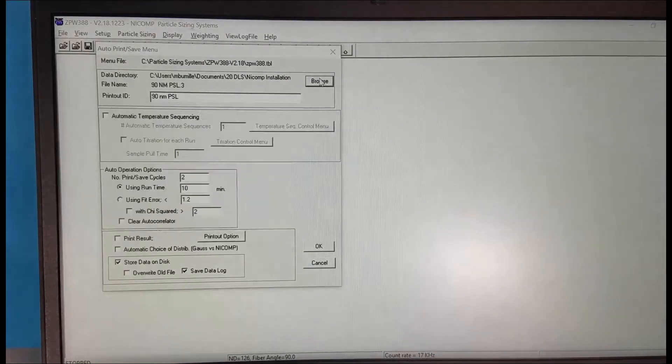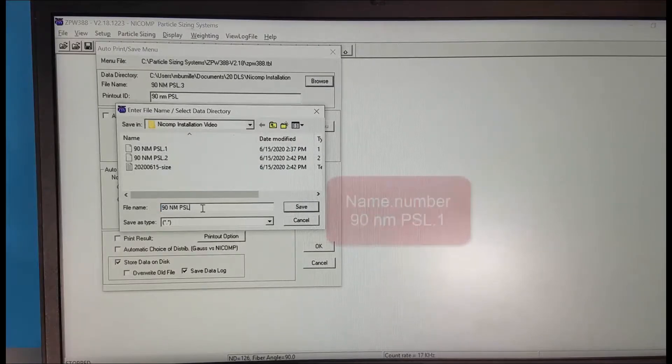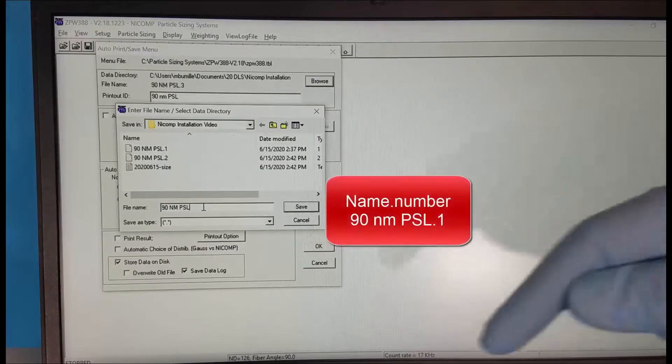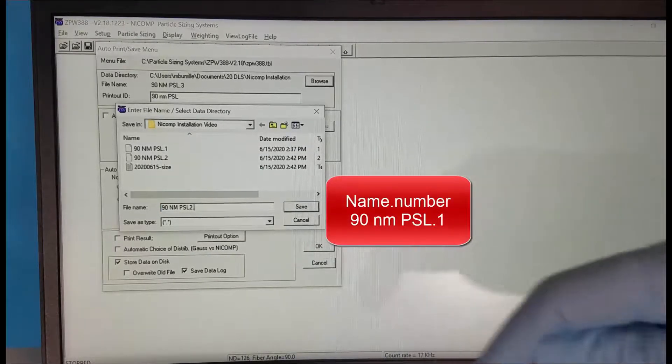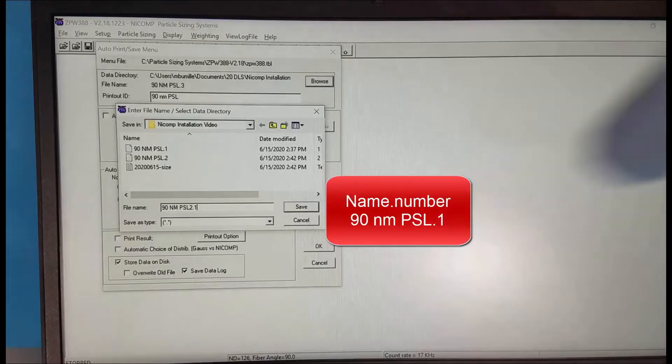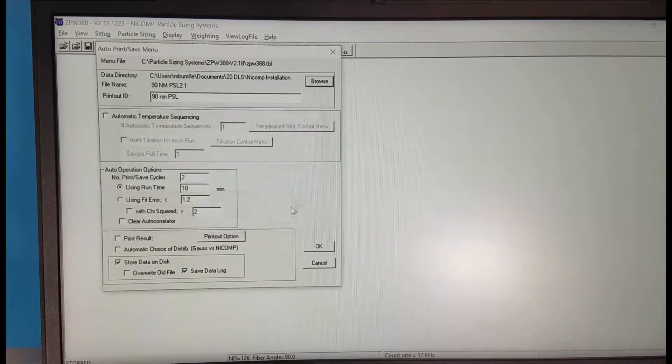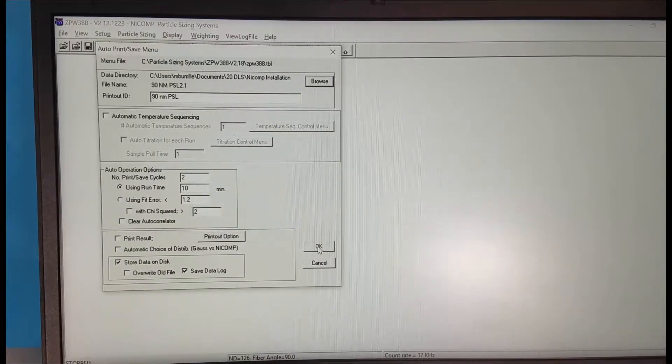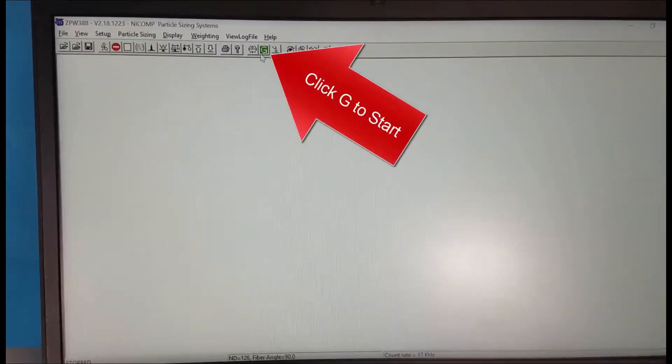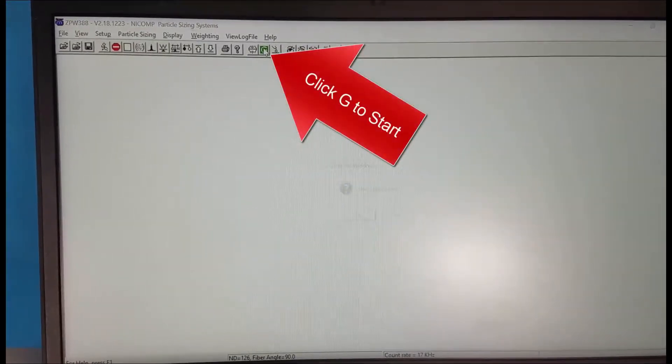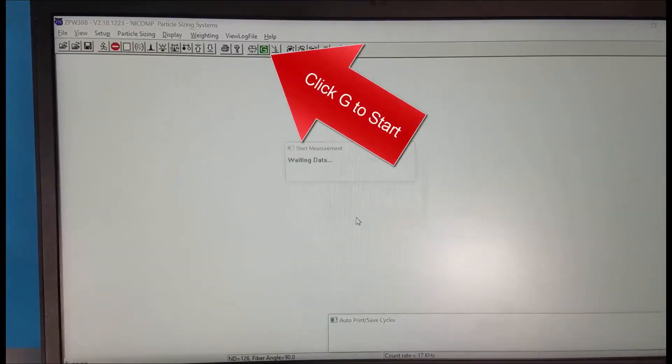Next we click on browse and this is where we enter the file name which remember must end with a period and then a number. If we click save and then OK we now have set up to make this measurement and we click G to begin the measurement.